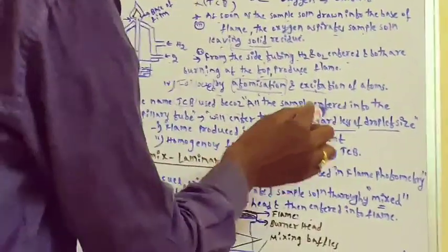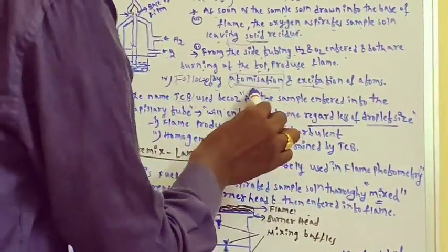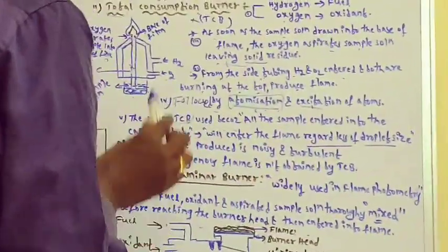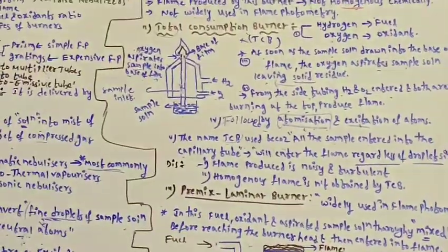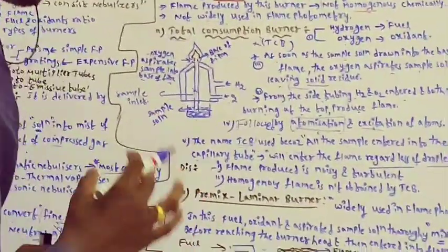All the sample, as you can see here, enters the flame. That's why it is total consumption. Total means all.